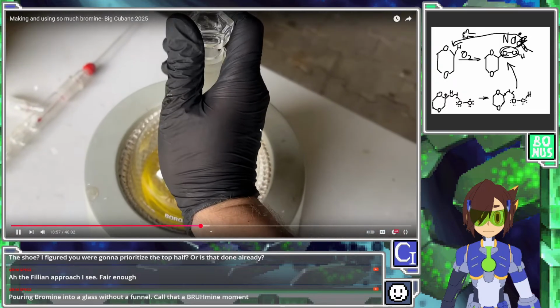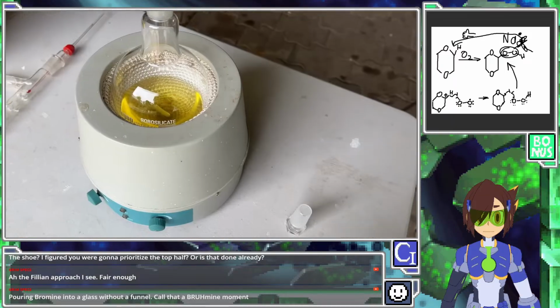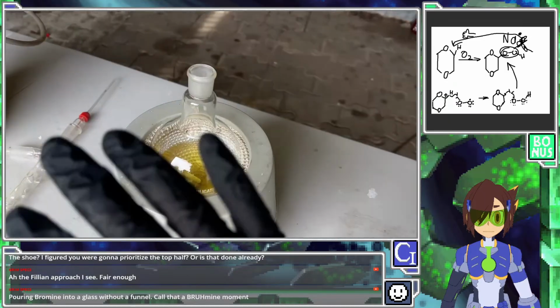So we're going to put the sodium in, the sodium reacts with the water and any peroxides and stuff. I'm sure the peroxides wouldn't have formed because it's over sodium hydroxide, blah, blah, blah, but I'm just overthinking it.